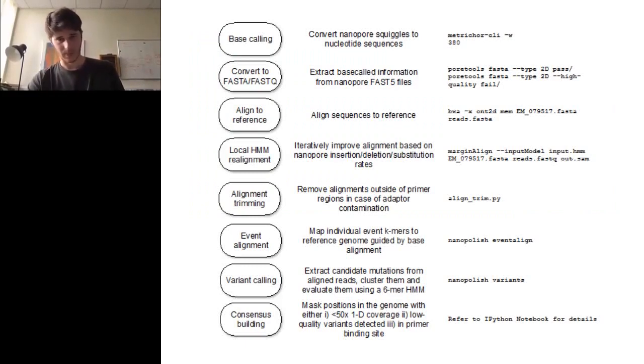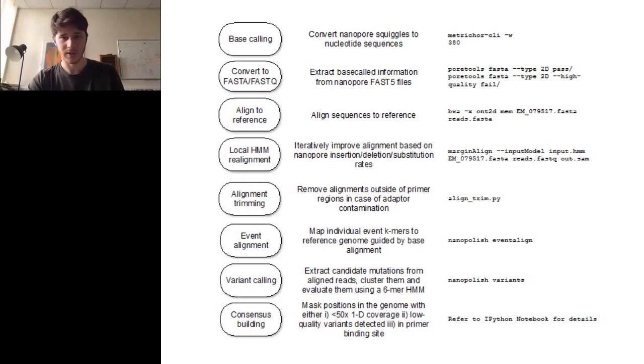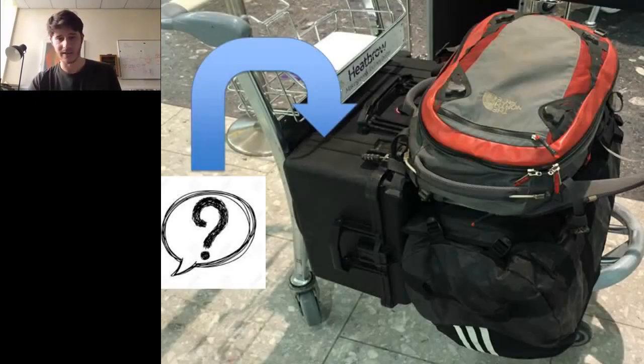So we came up with this big long bioinformatics pipeline, which has now been Dockerized, and we can run this on a laptop right there in the field. Things have really moved on a lot since then. But it's important to design your analysis properly, because MinION data is very different from other types of data, so it's necessarily complicated in this case.